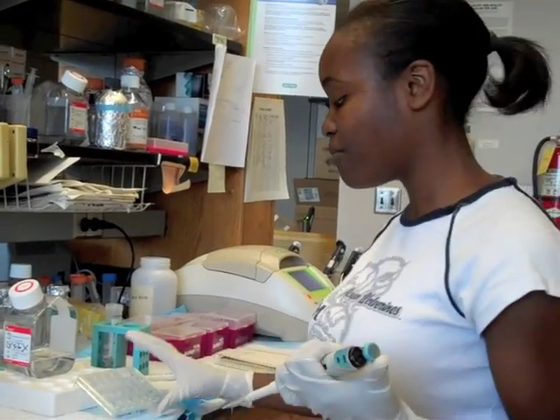I just finished washing the embryos with Triton X, and now I am going to remove the Triton X from the embryos that I have washed.